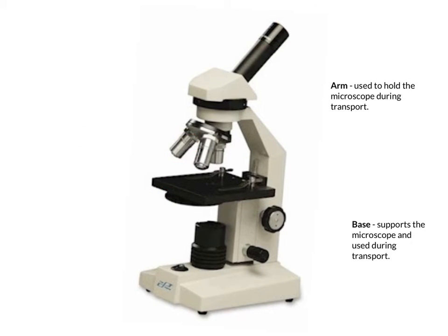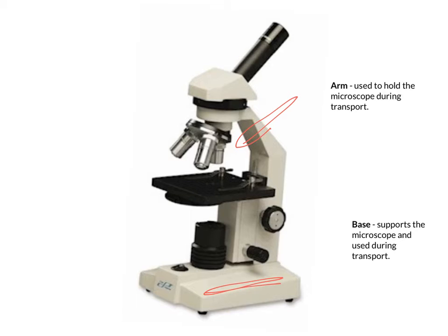Now that we know what a compound light microscope is, let's look at the different parts. First is the arm, which is used to hold the microscope during transport. The second part is the base, used to support and transport the microscope. You will use one hand on the arm and one hand under the base to support it while moving it from one place to the next.